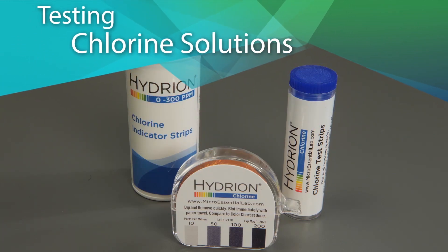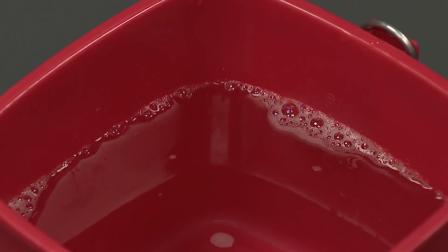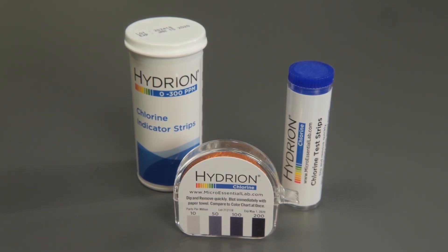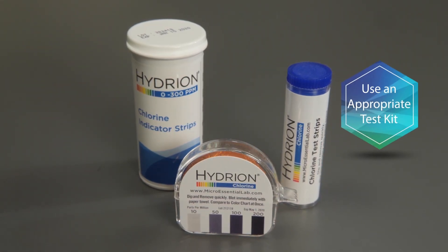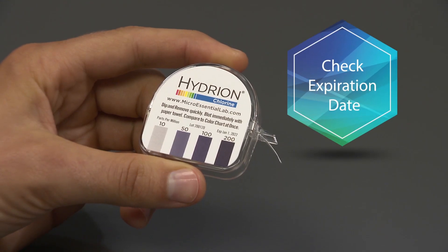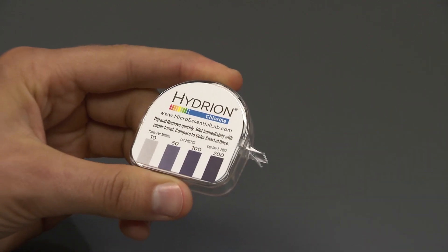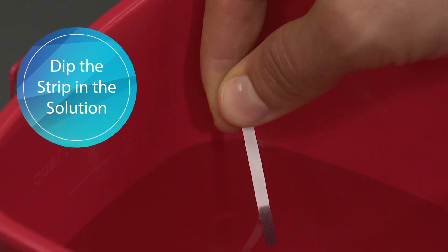Here's how to keep food safe and people healthy. Testing Chlorine Solutions: prepare the chlorine solution according to the manufacturer's instructions. When testing the accuracy of its dilution, use an appropriate test kit like CM240. Check the kit to make sure it hasn't expired, then tear off about two inches of test paper and dip the strip into a room temperature chlorine solution.